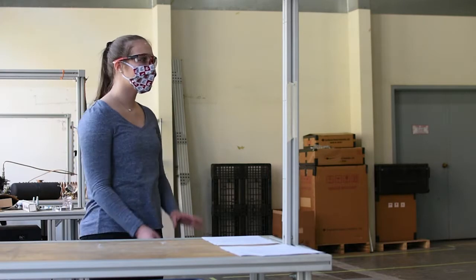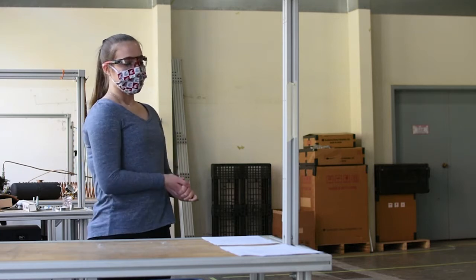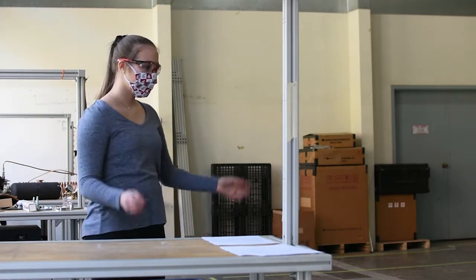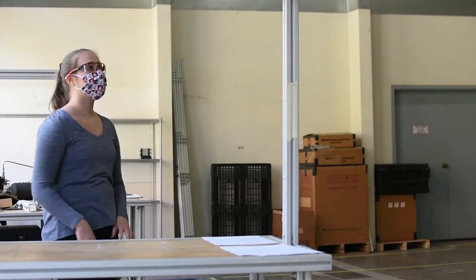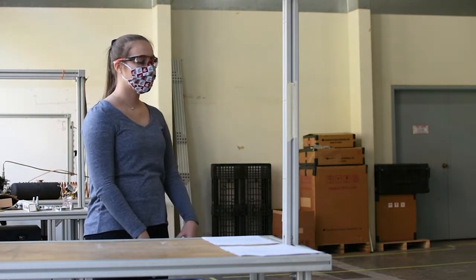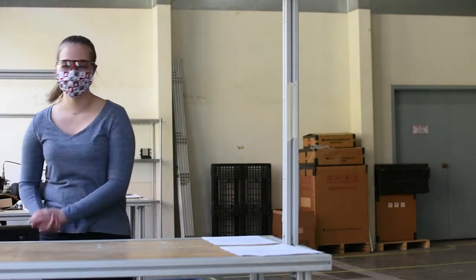And then you also want to observe the normal lab safety, so hair tied back, no long jewelry, that kind of thing. Safety glasses or a face shield, which everyone here has. And then finally, you want to think about your shoes. Leather boots or other waterproof shoes are top choice. Things like tennis shoes or things that can absorb liquid are not great. And we're going to do a demo to show you why.